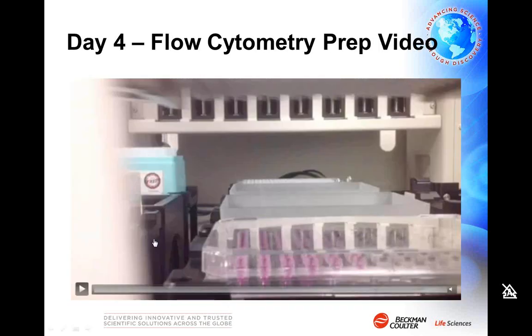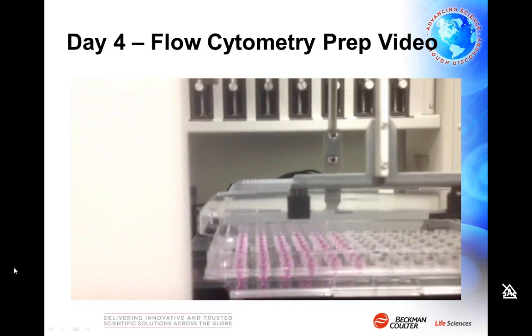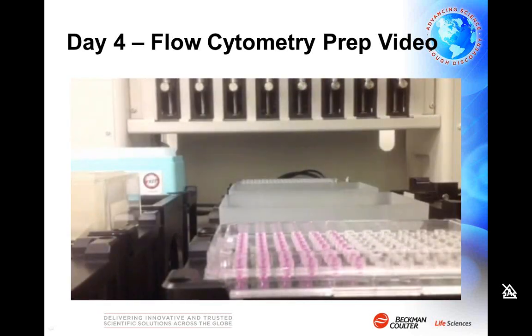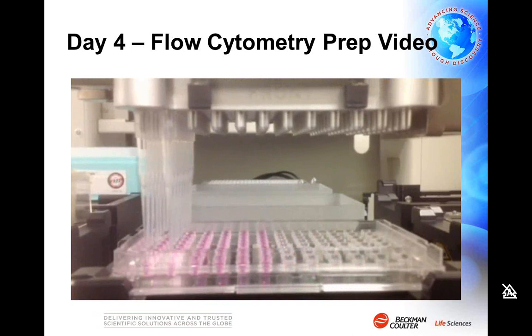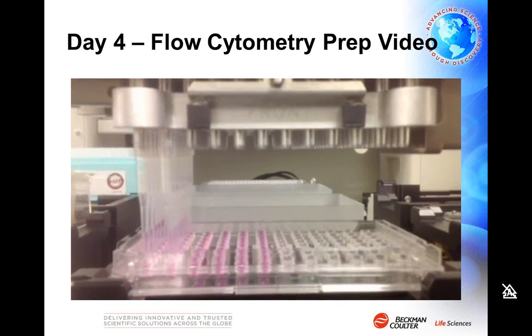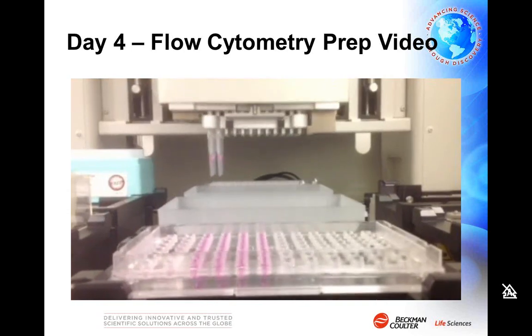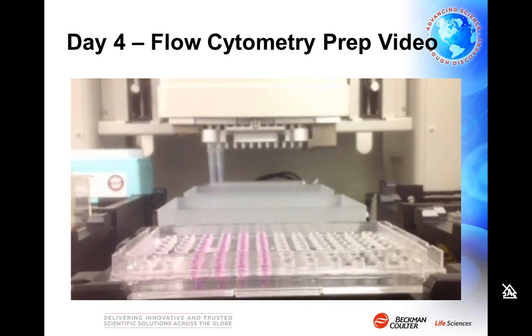And again, we've got a video here to illustrate the automation. Shown here again is just the Perfecta plate being delidded. And then we use the enhanced selective tips to take the first 2 columns worth of wells and mix them up and down to try and get the sphere into the pipette tips, and we dispense it into a plate with PBS that had been added by the Span-8.